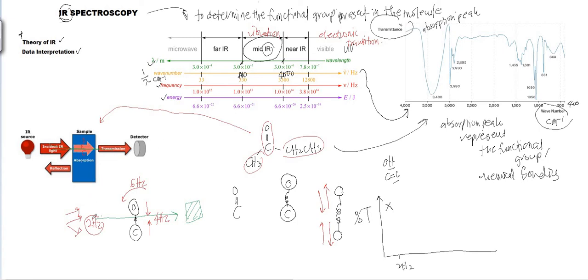But once, for example, it gives you 4 hertz, because it keeps giving from 400 to 4000, right? For example, tiba masanya 4 hertz, once it goes to the 4 hertz, you know that it matches with the frequency that the carbonyl needs to do the vibration, which is the stretching, so it will absorb the 4 hertz electromagnetic radiation. So once it is absorbed, there is no coming out, the transmit ni.